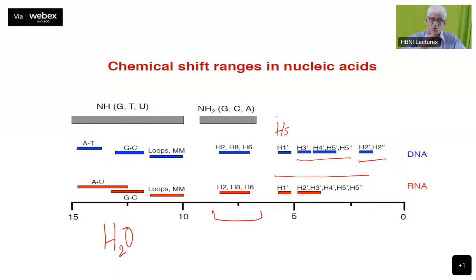Sometimes in a very strong hydrogen bonded network, like in the G quadruplex and triplexes, which have hydrogen bonded aminos, their exchange rates are reduced, and you will see NH2s also. Therefore, all of these things one has to remember to analyze the NMR spectra of the nucleotide units.